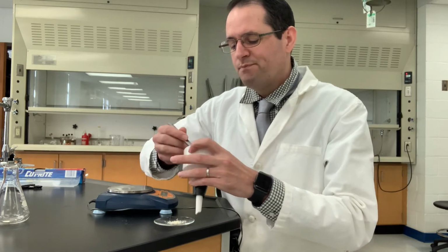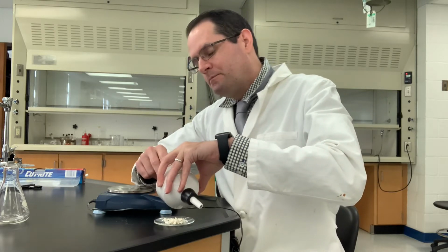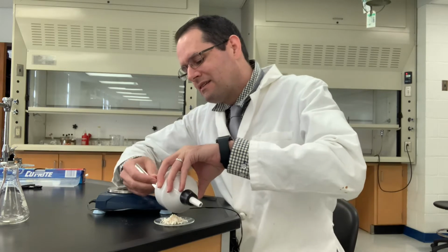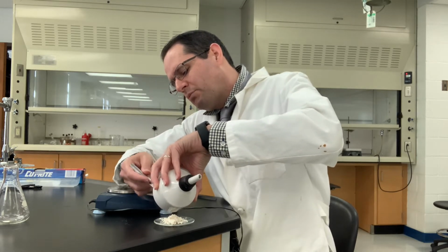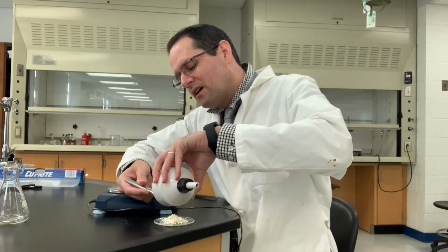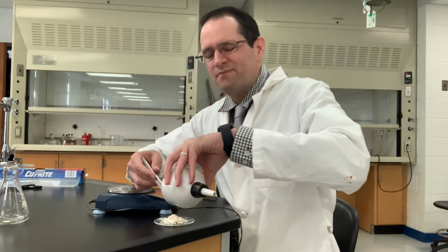So this might need to go a few more days, and it's Tuesday today, so maybe by Thursday it'll be fully dry. Not quite as free-flowing as you would expect a dry powder, kind of like flour. It's more like clumping together, so I think it's a little bit wet still with water. It always takes water a little bit longer to evaporate from an organic solid than it is for something like methanol or ethanol, which have lower boiling points and higher vapor pressure.